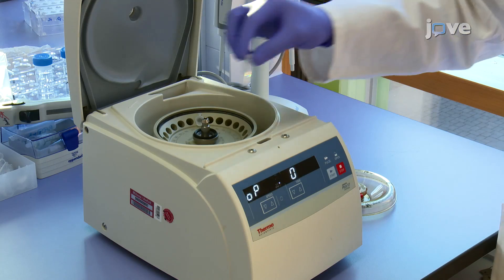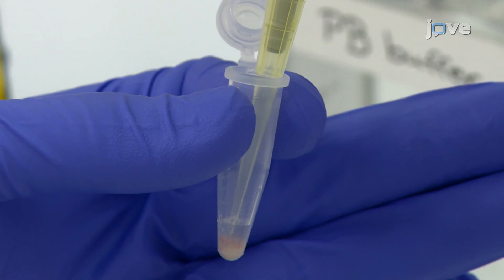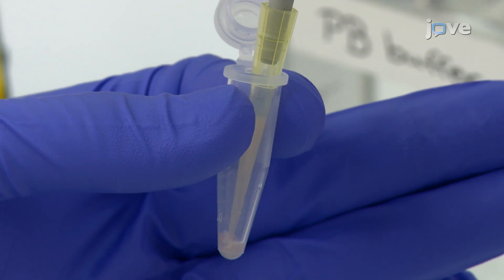After counting, collect the cells with another centrifugation and re-suspend the pellet in 80 microliters of PB buffer per 1×10^7 total cells. For this step, it's important to use a microscope and trypan blue exclusion rather than a cell counter to obtain an accurate count of viable cells. Cell counters frequently exhibit problems handling heterogeneous samples after tissue dissociation.